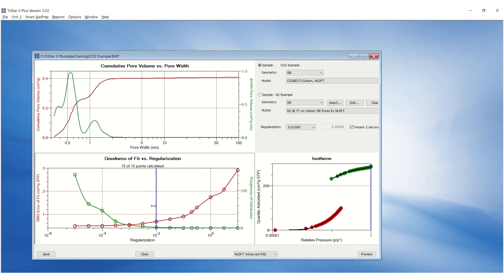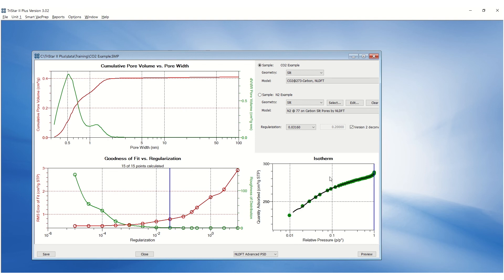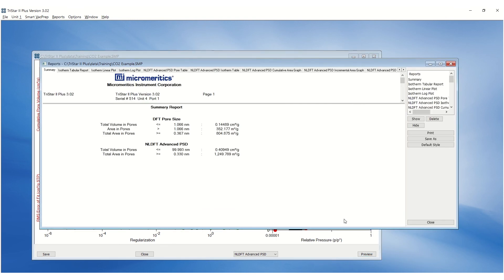As you adjust the regularization, you can see if the model in the black line fits the data by zooming in on the graph in the bottom left corner. Click on Auto Scale All Axes to zoom out. Click on the Preview button to generate a report.